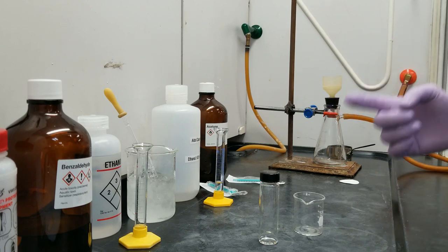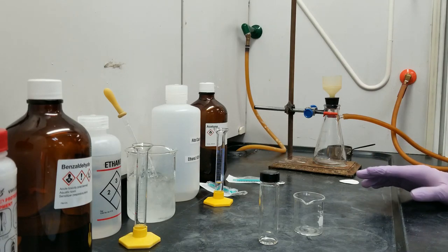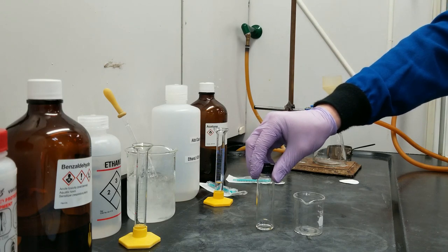Two benzaldehydes are combining with one acetone to make a single di-benzal acetone product. I'm not going to get into the mechanism right now — I'm just going to jump straight into the procedure. This whole thing is actually just a hand-shook reaction because it occurs rather quickly.